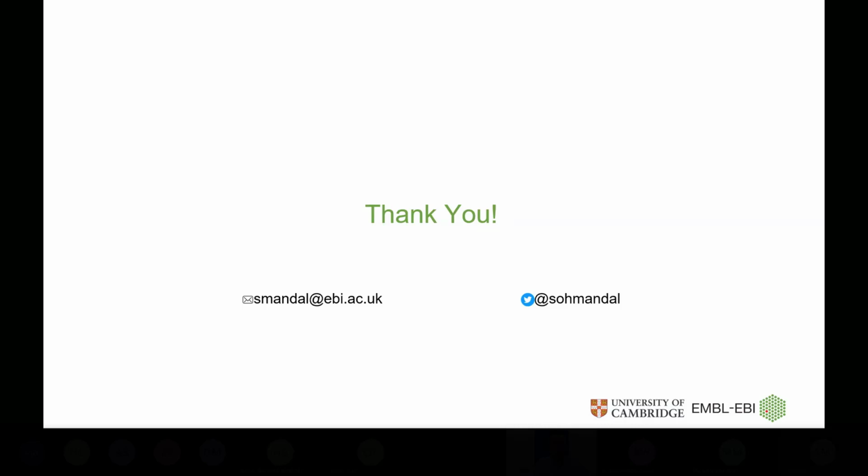Well, frankly speaking, we haven't yet started designing the SplineDist 3D one, but that's very much on our to-do list. But I can already envision the spline model that we would need for the 3D segmentation would not be as straightforward as this, because that itself brings tons of challenges to put in such pipelines. So I do not have a very concrete answer for you yet, but I assume there would be quite an amount of challenge in terms of 3D.